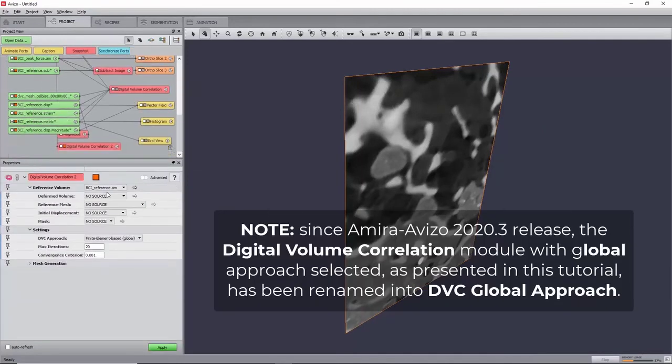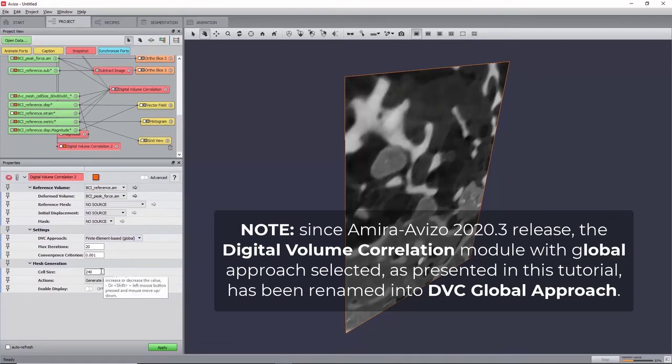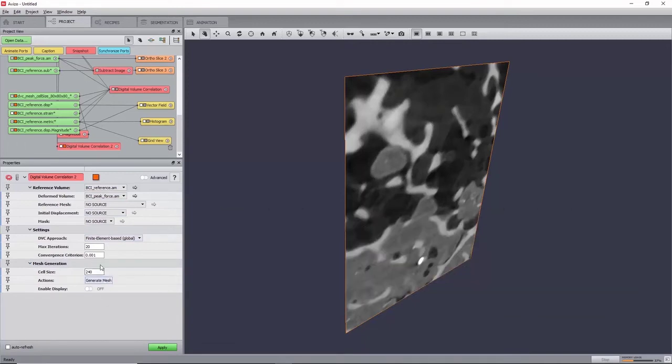Connect the deform node just previously. We will now generate a tetrahedral grid using the mesh generation section. Set the cell size to 56 and activate enable display. You will now see the nodes of the mesh.